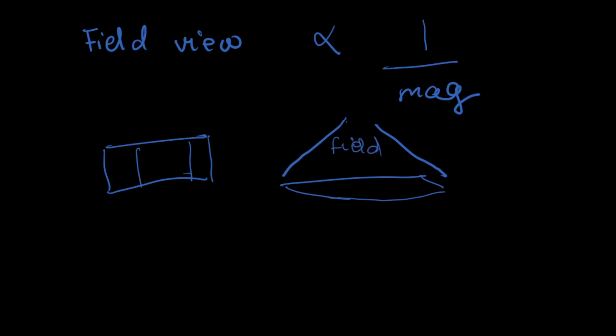And at low magnification, depending on the size of the tissue slice, we might be able to see the tissue slice in full view. However, as the magnification increases, say at times 40, the field of view is reduced such that now we might only be able to see this section. The field of view is decreased, however the resolution and magnification is increased, so we are able to see more details. However, the field of view is reduced.